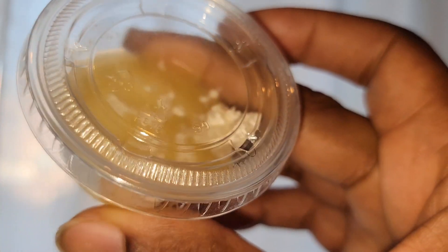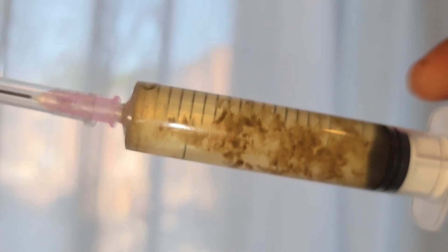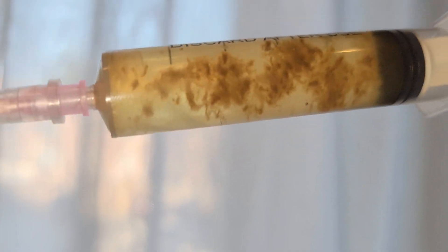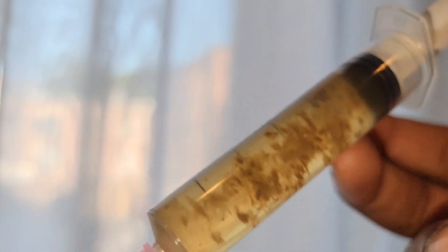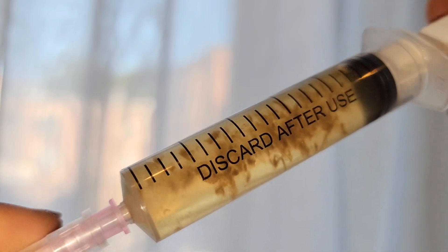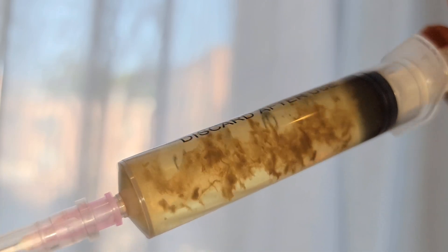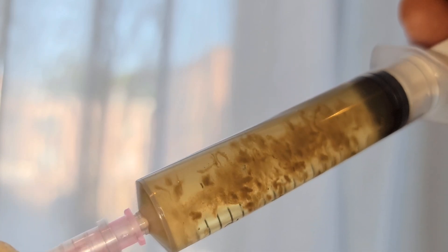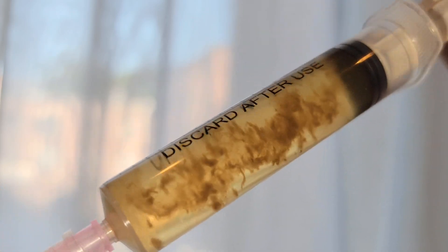Once you have your agar looking clean, or a clean liquid culture with strong connective tissue — although lion's mane tends to break apart easily — having good connective tissue is typically a good sign of healthy mycelium without contamination. Keep in mind that you should do all contamination work, such as isolating mycelium away from contamination, on agar, because once you go to liquid culture it will be difficult to tell the difference.